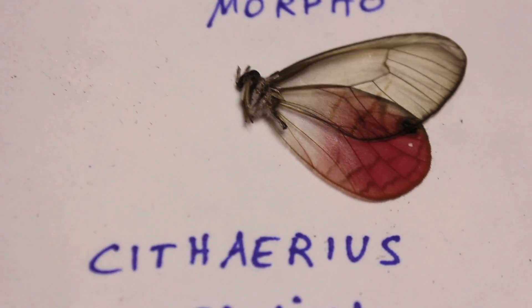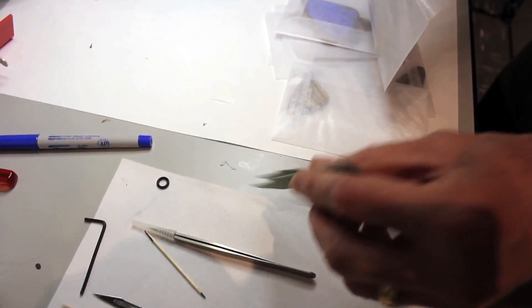What I think is interesting about the cythereus is that it goes from a scaled wing to a transparent wing. The unfortunate thing here is that this is destructive testing. Well, it is what it is, man. We've got to do it.